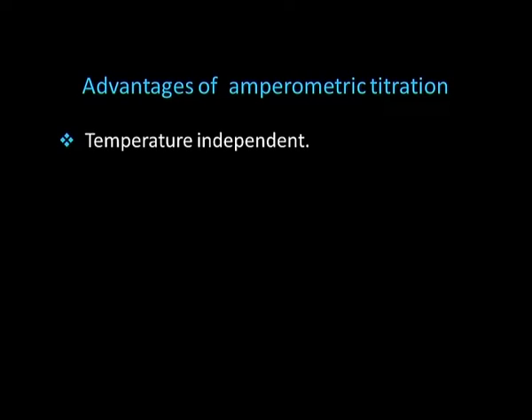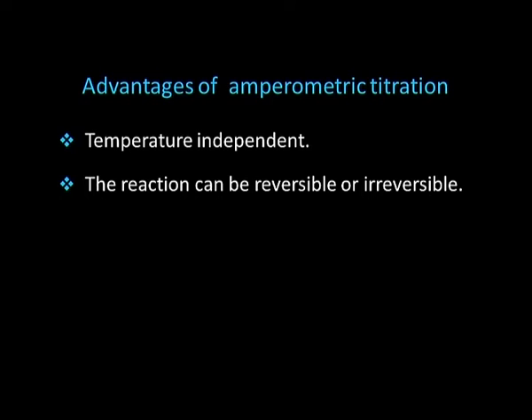The next advantage is that it is temperature independent. There is no effect on amperometric titration by variation of temperature. The reaction can be reversible or irreversible, it does not matter. The amperometric titration will provide you significant and similar results.